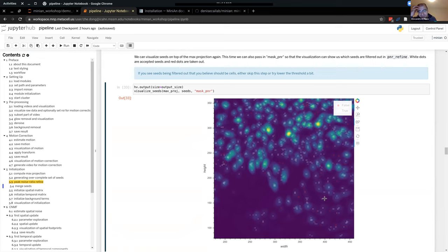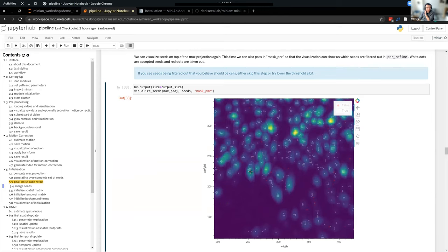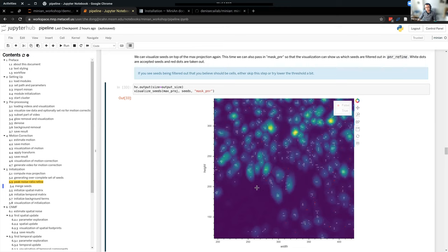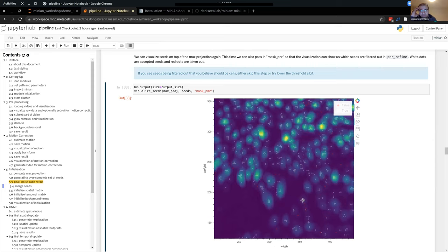What does the number of seeds on a cell tell us? If a cell has a lot of seeds, it probably means that cell is very active. These seeds are generated by taking local maxima on max projections of subsets of frames, so if you see a bunch of seeds on the same cell, it means that cell was active in all kinds of frame subsets. Every time it was active, a local maximum was computed and recognized as a seed. Since we're taking the union of all of them, that's completely expected.